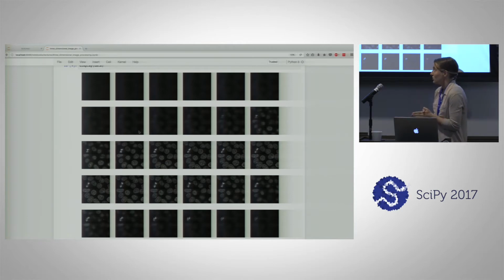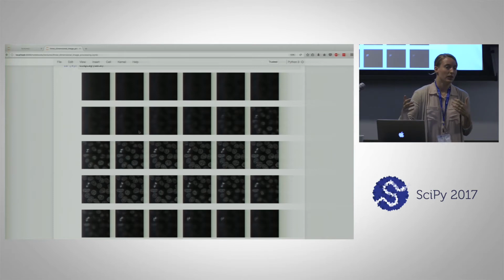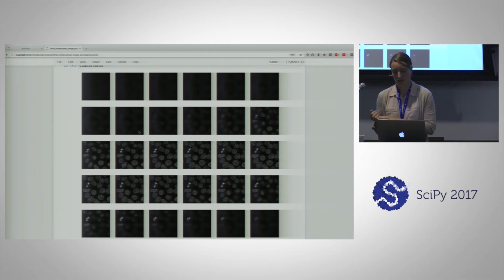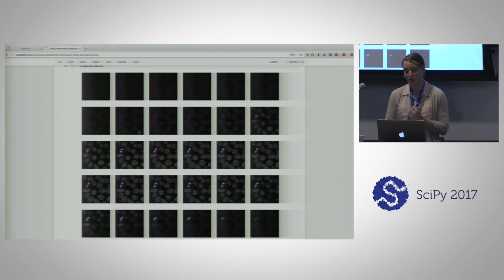So our goal today is to segment this image. We want to identify and assign a unique number to each nucleus in the image. We'll do that by following a series of steps which will enhance contrast in the image, giving us a better distinction between the foreground and the background. We will denoise the image to get rid of spurious fragments, bits that are wrongfully bright or wrongfully dark. We'll also binarize the image, and then we'll apply our labeling. And once we've got a good segmentation, I'll walk you through feature extraction for 3D images.